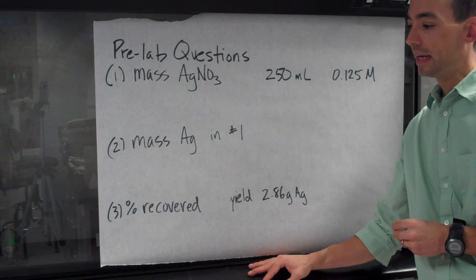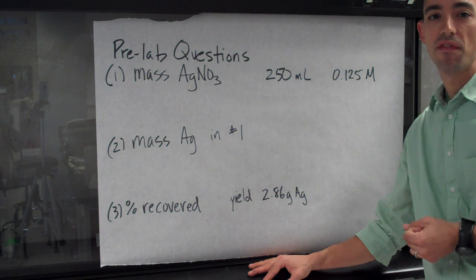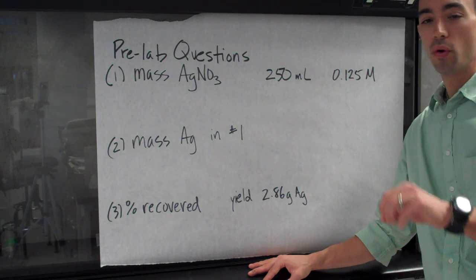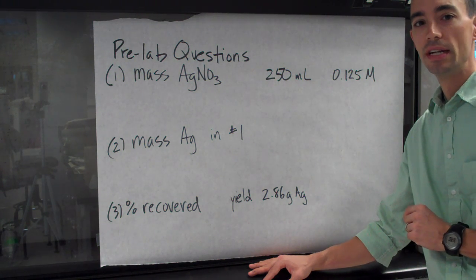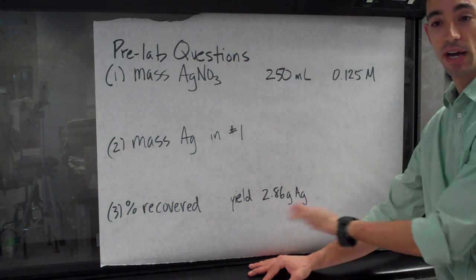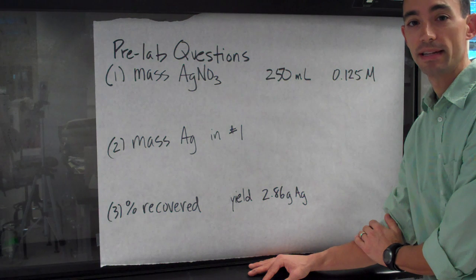And we want to remove that because we don't want that weight in our final mass calculation. And so we'll pour these solvents over top of our copper, but we want to make sure there's no flames, no ignition sources nearby, and you'll be working in the hood at that point. So it'll be best if you have your entire apparatus, like I just showed you, set up inside the hood.